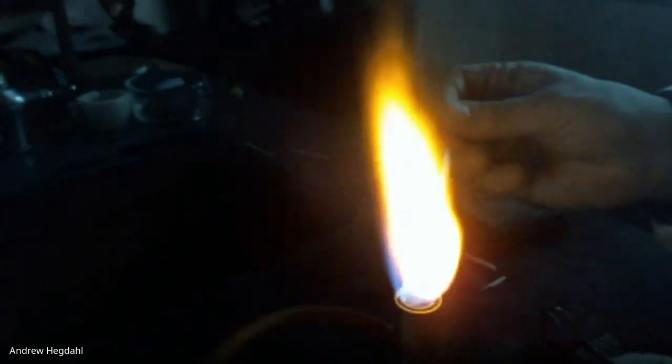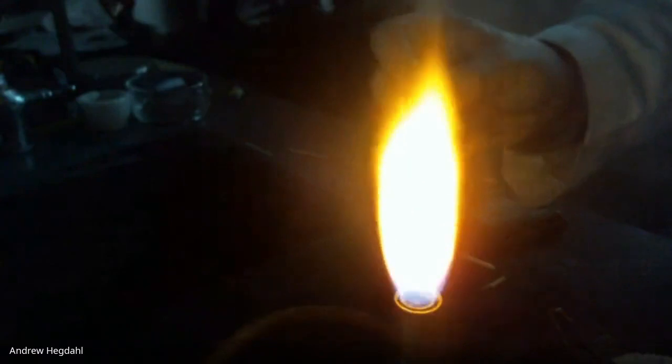All right. So Marley and Maddie, I'm going to find letter A here. I have the wood splints up at the front of the desk as you need them. Okay, so here goes letter A. Oh, it looks orange on the camera, but it is red in person. It's like an orange red. I'm going to try moving back the camera and maybe it won't be so bleached out. So if you're describing the flame, I would say like an orange red.